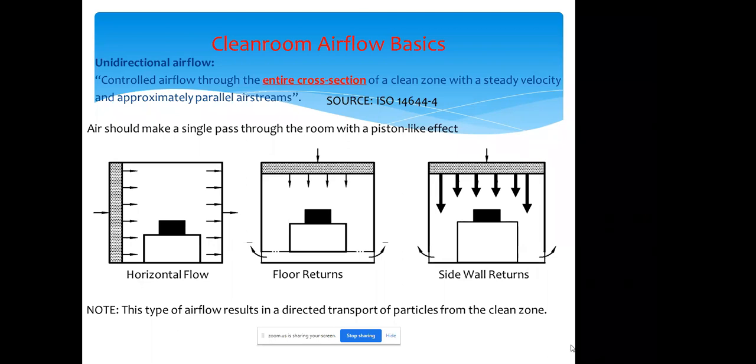The air circulates. And the middle one is our type of clean room where you have your terminal HEPA filters up on the ceiling and air flows unidirectionally, and you have perforated tiles right here where all the particles are washed in. They go in through the subfloor, and the air is recycled back to the filters and then back to the HEPA filters. This is another type of unidirectional airflow where you have sidewall returns instead of the subfloor returns.